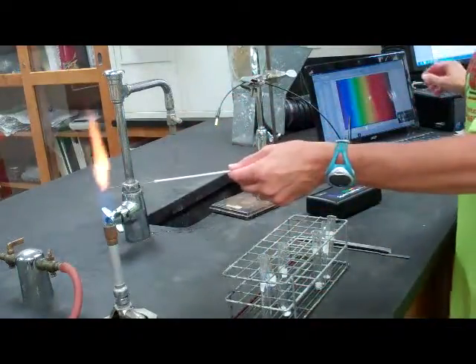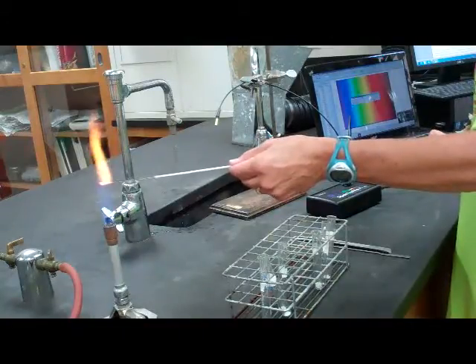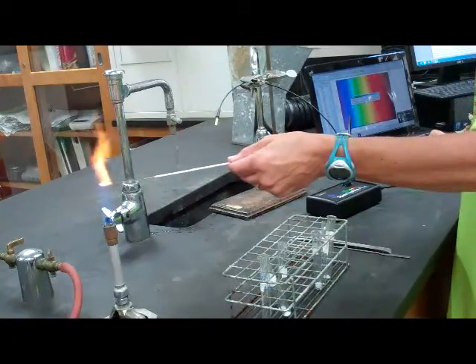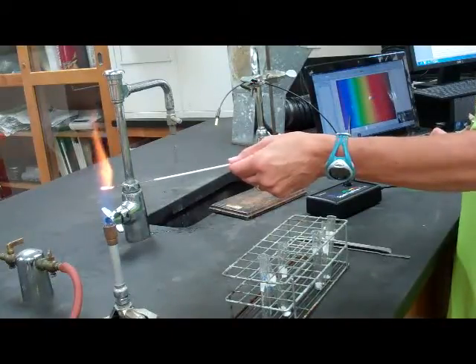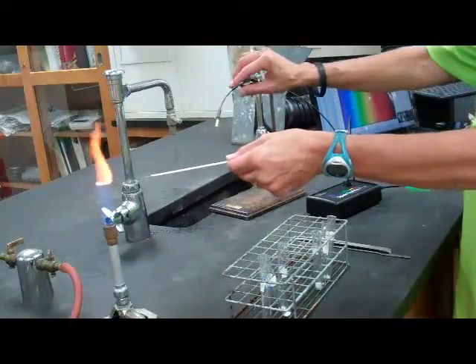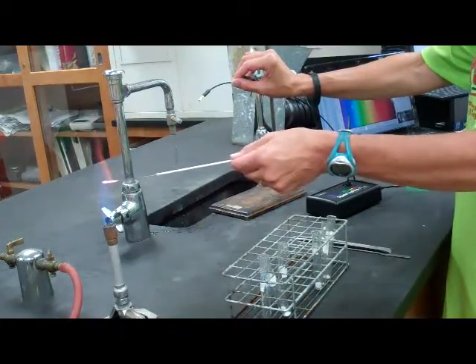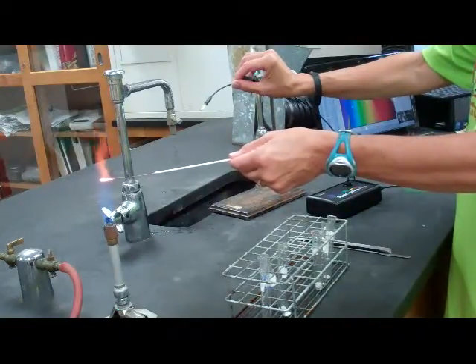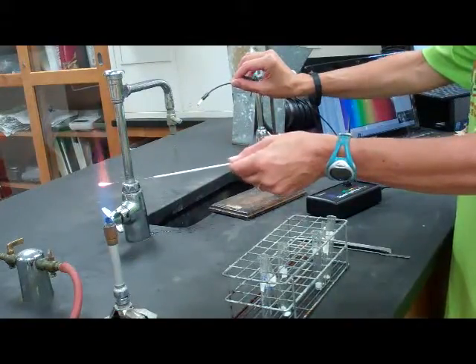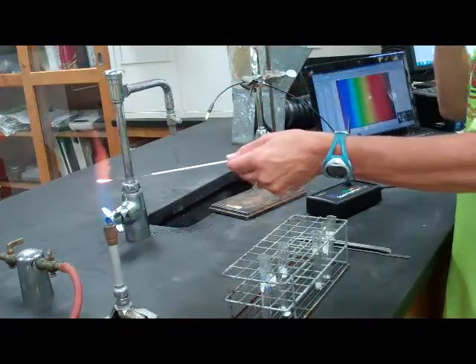Definitely have a color change. Hit collect. Store the latest run, and our cable is sensing a different color. And we have some peaks in a slightly different region.